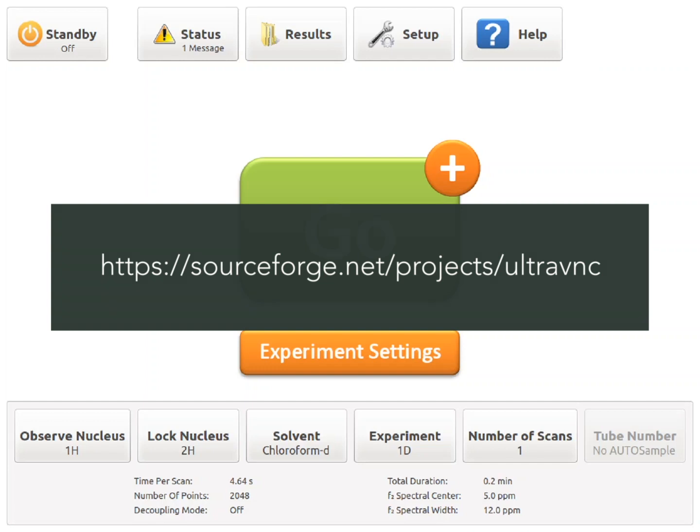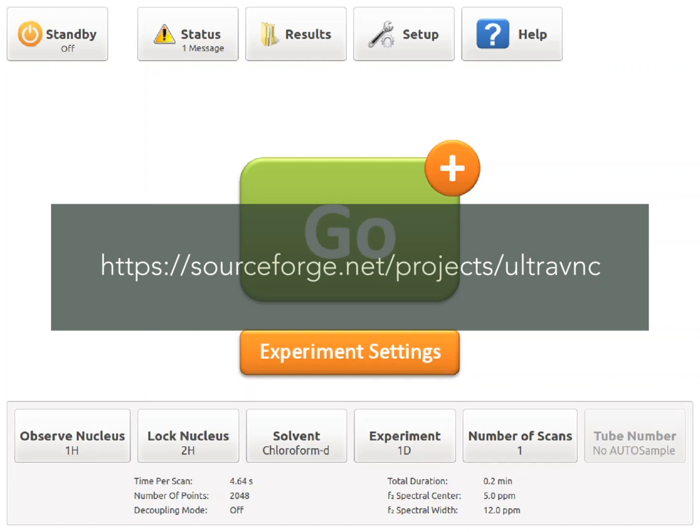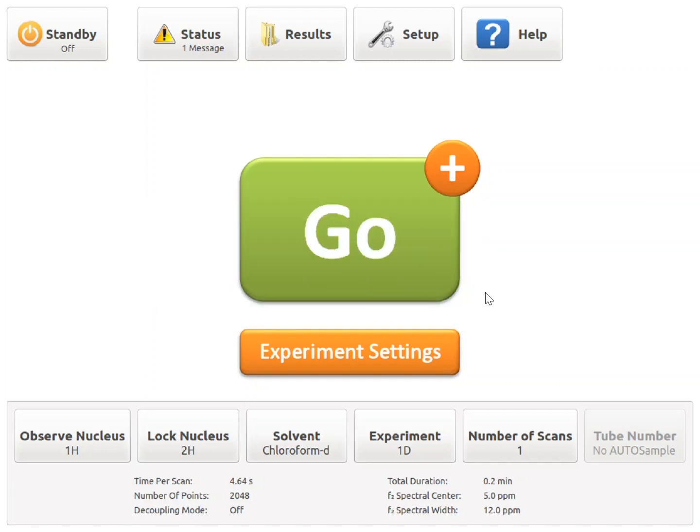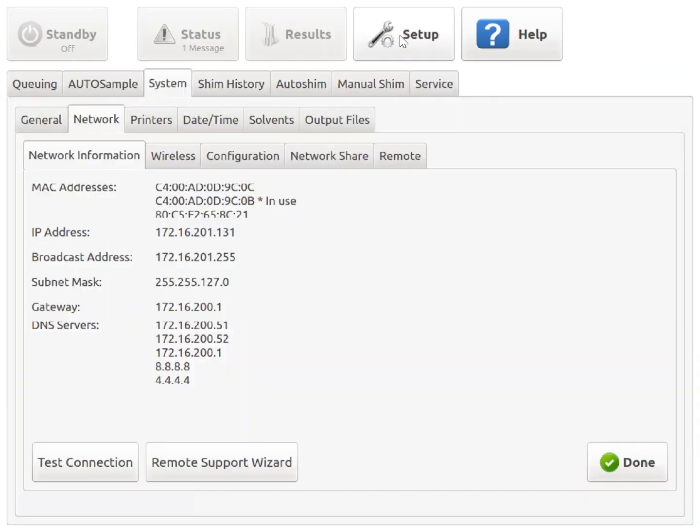Once everything is ready, take the instrument off standby mode and navigate to Setup, System, Network, and Remote.